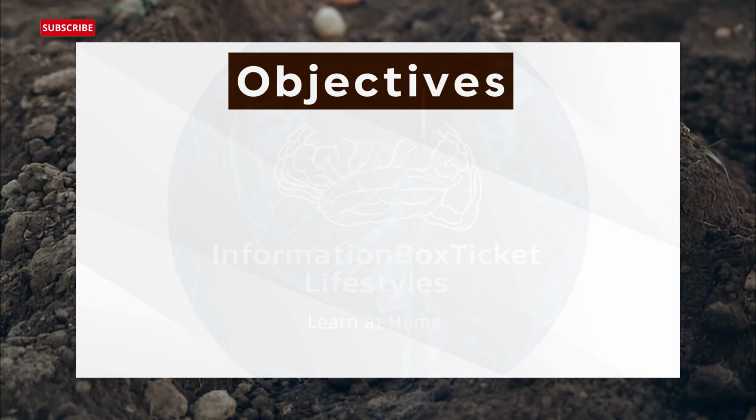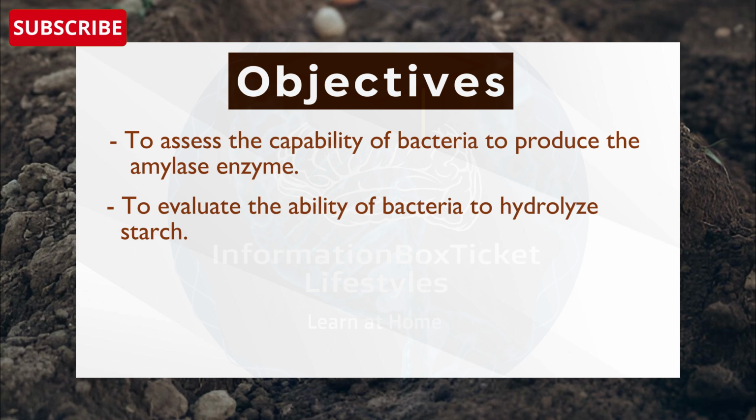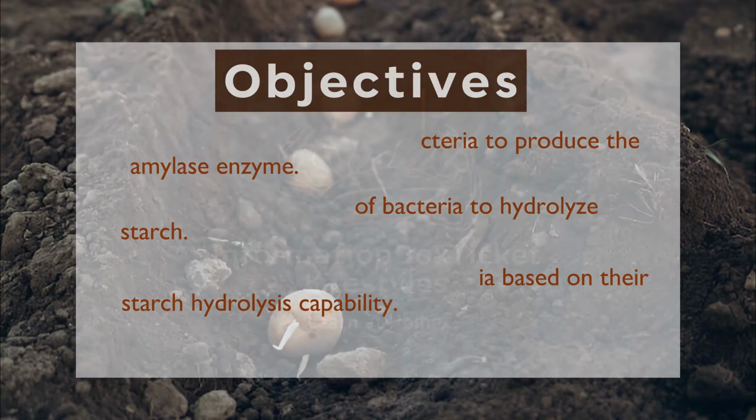Objectives of Starch Hydrolysis Test. To assess the capability of bacteria to produce the amylase enzyme. To evaluate the ability of bacteria to hydrolyze starch. To differentiate and identify bacteria based on their starch hydrolysis capability.